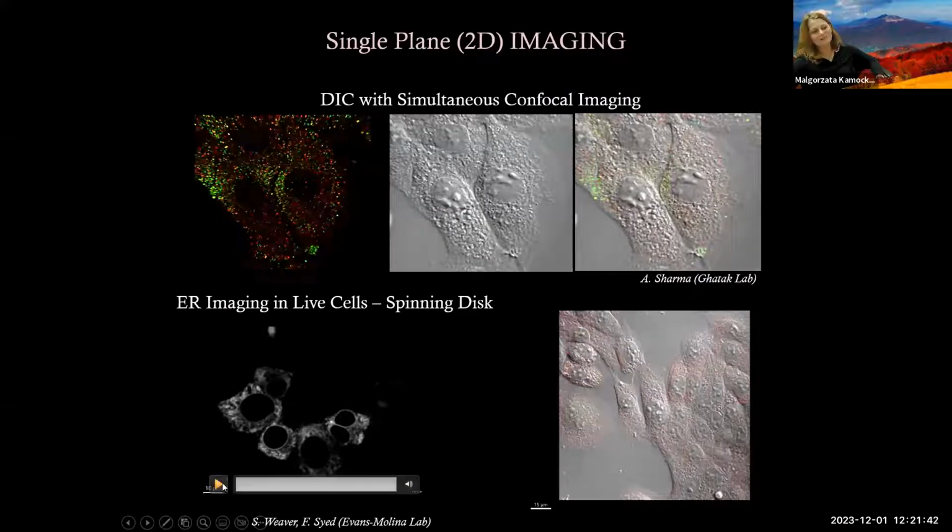Let me play it again because I know I made it super short. Oops, maybe I cannot. So it really collects images even at 30 frames a second. Of course, it would be one channel acquisition, but it's a very, very sweet system. And actually, I had to mention that one because it's my boss's favorite microscope. So I had to include that image as well.